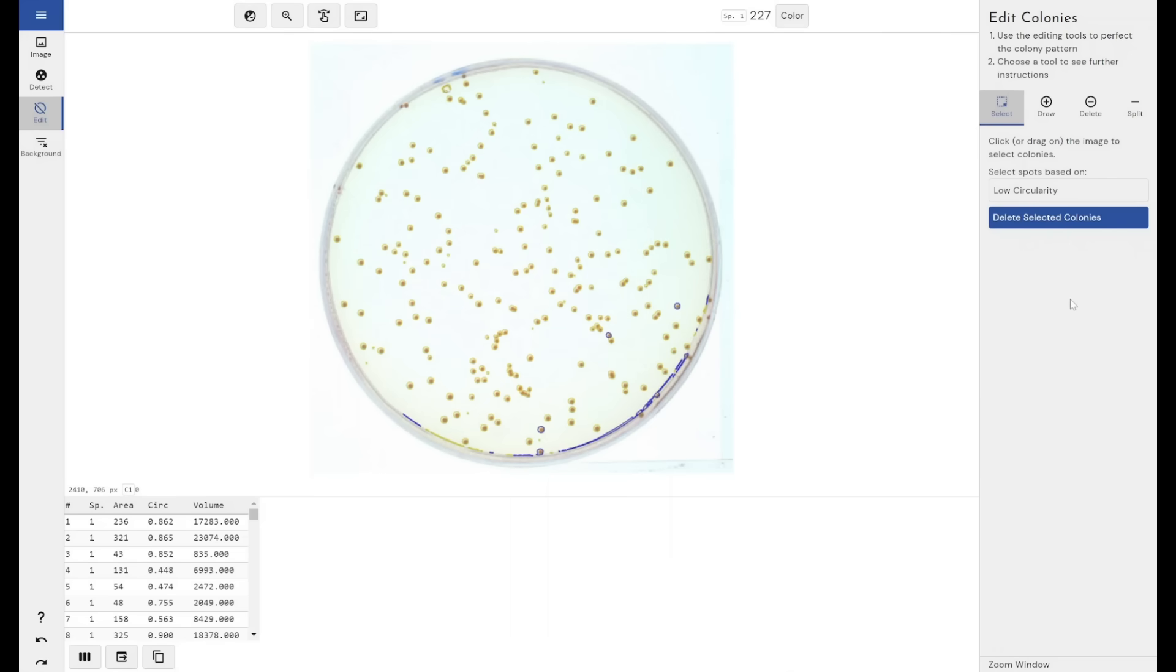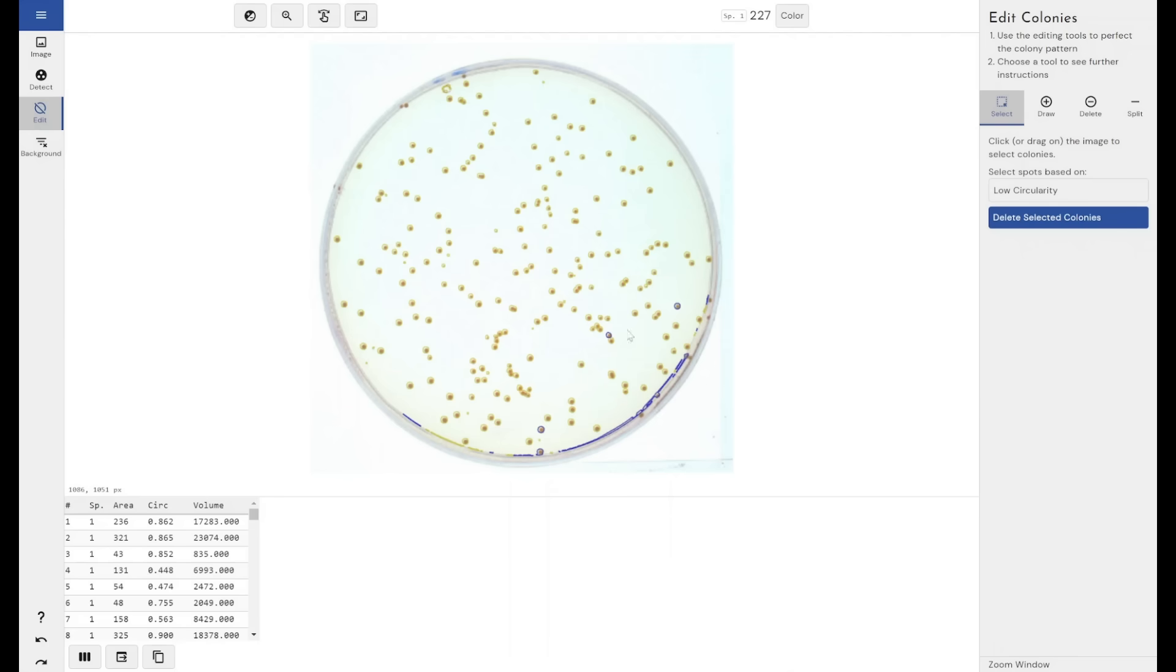It's useful for deleting aberrations or anomalous results. So if you've got like a hair on this plate, or just a random particle that shouldn't be there, the low circularity detection will allow you to automatically detect those most of the time. You'll see that it has detected some of my colonies, so I'm not going to use this now.